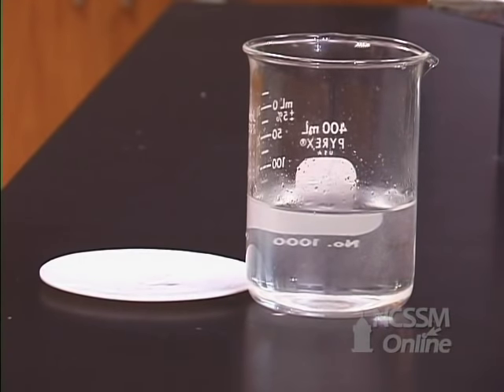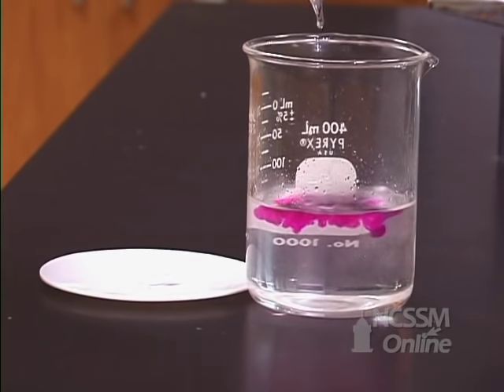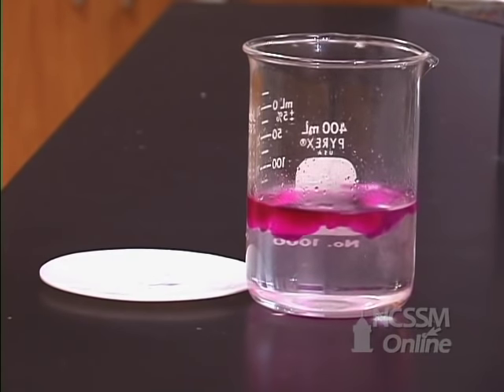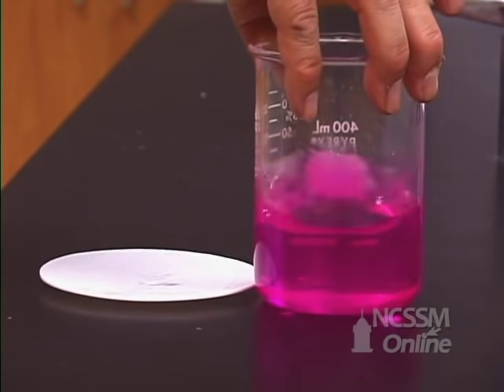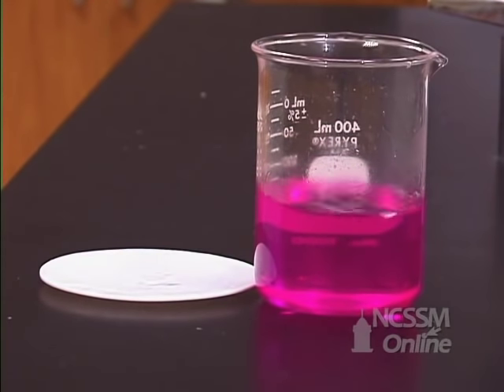We can test that the lithium hydroxide has been produced by adding an acid-base indicator. If we add some phenolphthalein, phenolphthalein is colorless in acid and red or purple in base. We can tell that the solution is basic due to the formation of the lithium hydroxide.